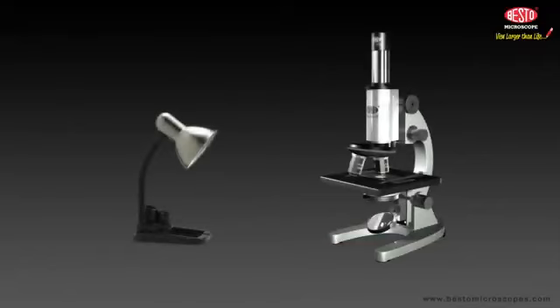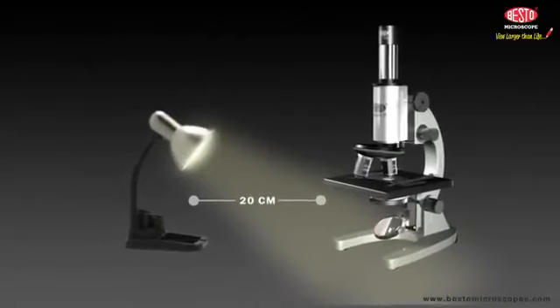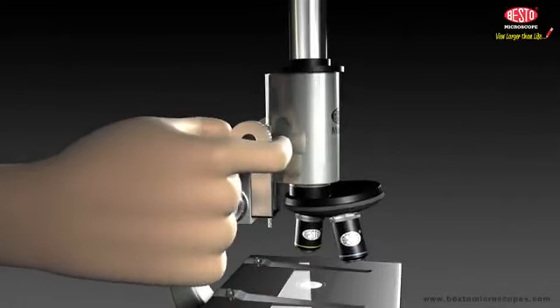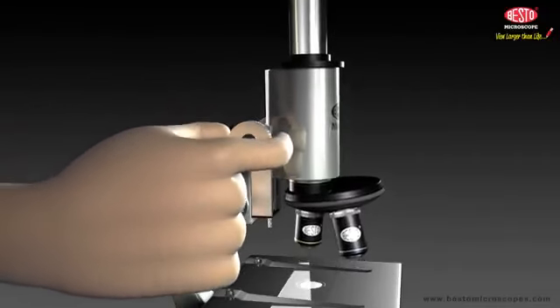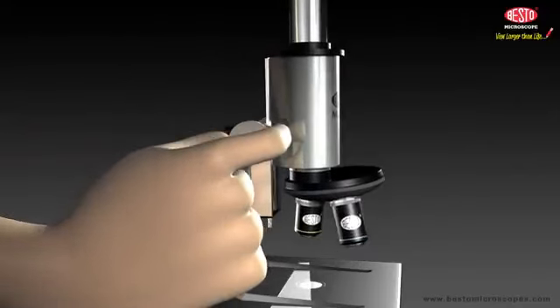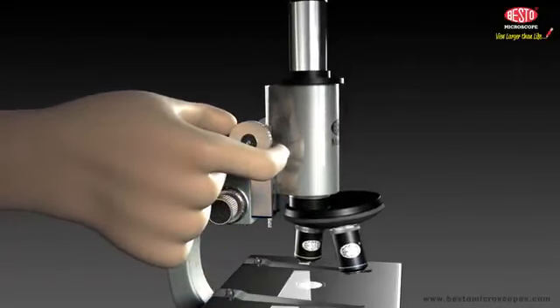Step 6. If you are using a lamp for your lighting, put it about 20 cm away from the microscope. Adjust the lamp so that the light points towards the mirror under the stage. Step 7. We have already told you in Step 2 that the low power objective is in place over the hole in the stage. Look through the eyepiece and use the coarse adjustment knob to focus upwards or move away from the sample or slide. This should bring the slide or sample into view. If you go too far, simply begin again at Step 2.